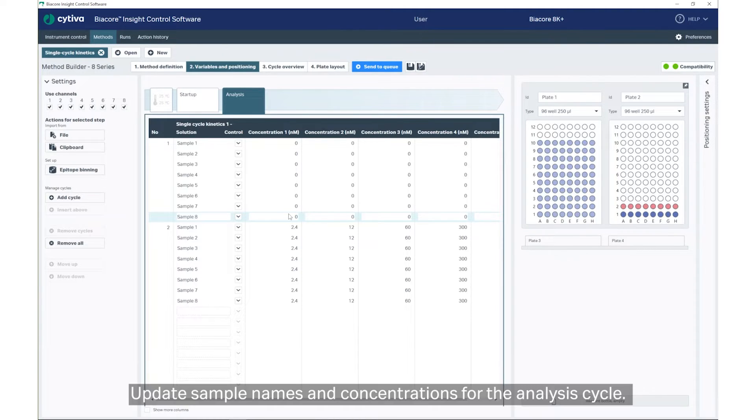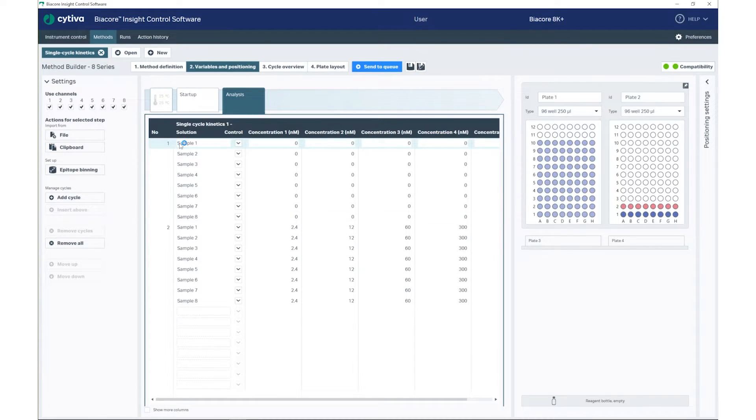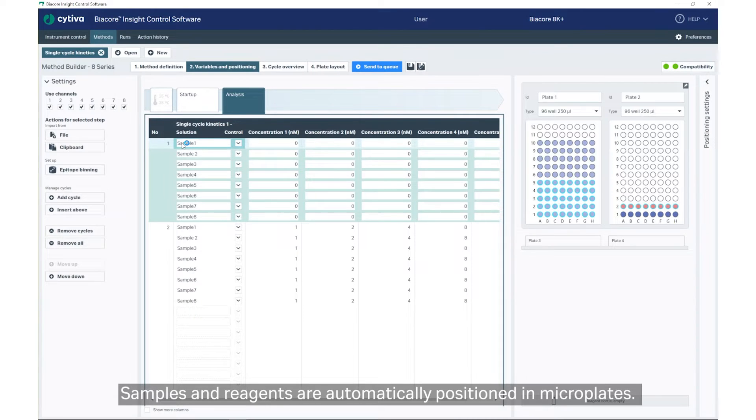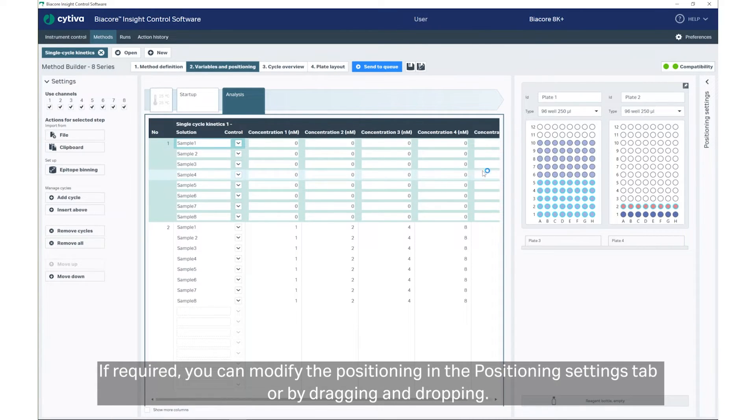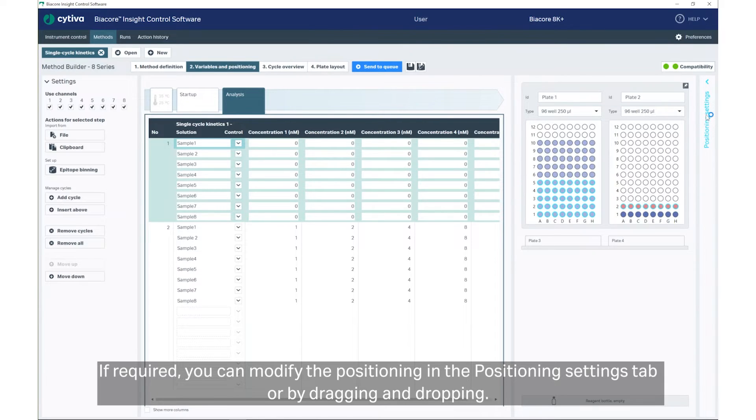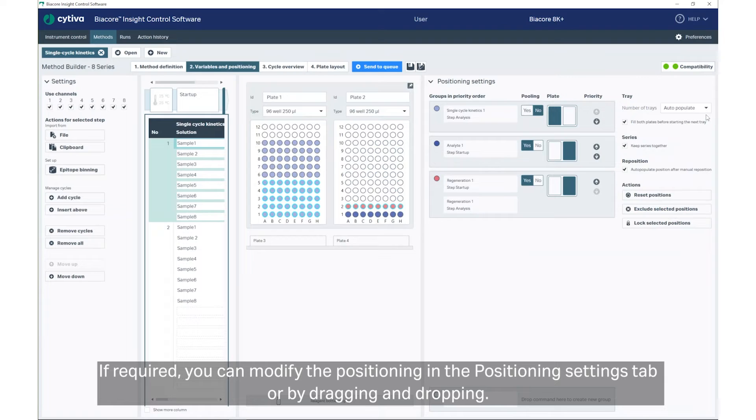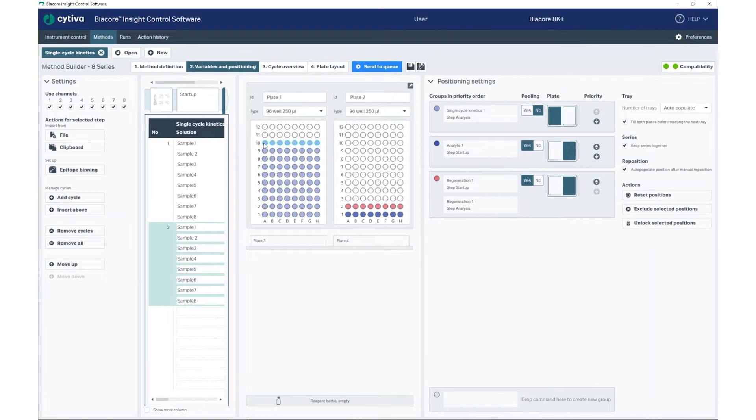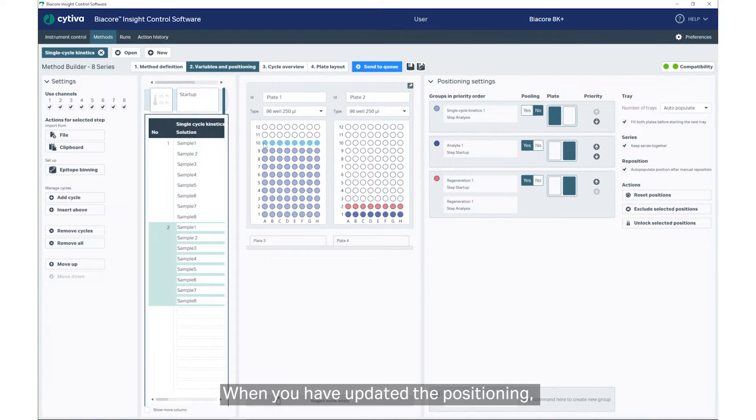Update sample names and concentrations for the Analysis cycle. Samples and reagents are automatically positioned in microplates. If required, you can modify the positioning in the Positioning Settings tab, or by dragging and dropping.